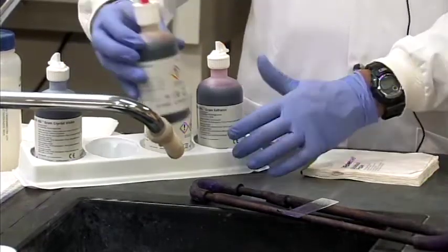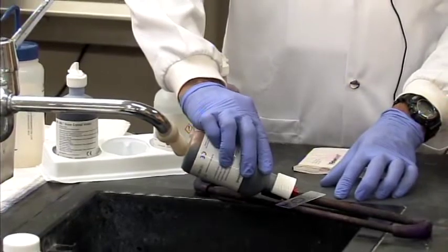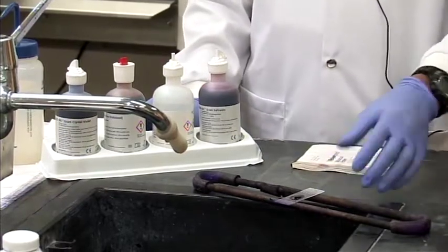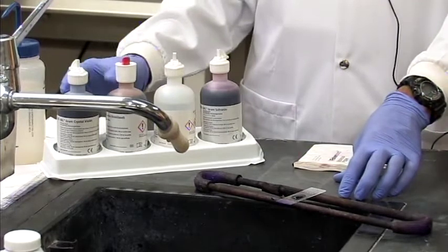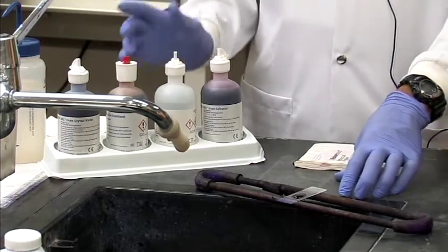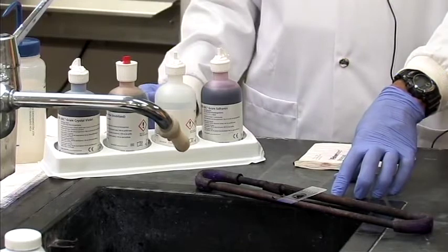And now we're going to add a drop or 2 of your iodine. Again, this must sit and react for 1 minute. So again, think about the reactions happening here now. The iodine, as we said, forms a complex with that crystal violet within the cell walls. And at this stage, both gram positive and gram negative cells appear a purplish color if you were to view them under the microscope.